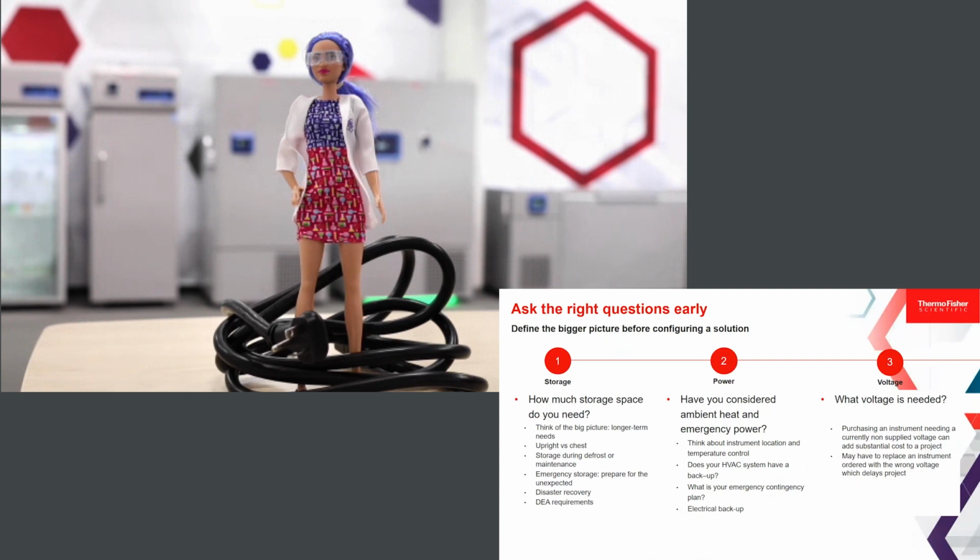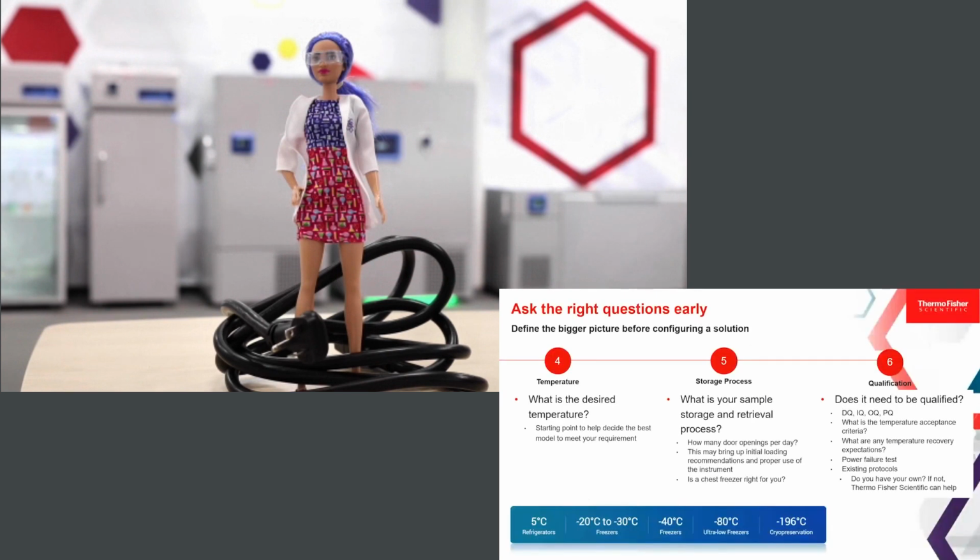So when you get your cold storage unit, you don't want to be stuck without being able to plug it in. And I can tell you from experience that this has happened so many times in the field where there might be a bit of a disconnect between where the final landing place is for a cold storage unit and who's ordering it. Definitely have that conversation before the order. It'll save you time. It'll save you cost for any exchanges or new orders that you have to place because of that. So this will get you up and running much quicker. So thank you, Dr. Roberts, for that reminder.